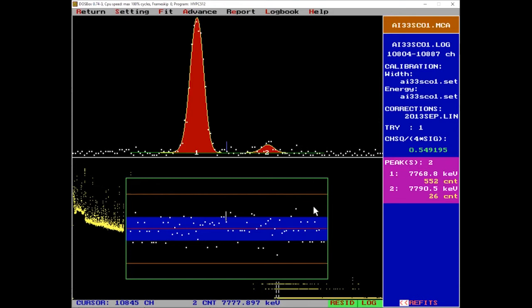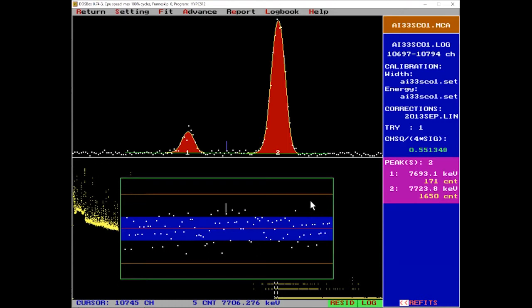and it should be like this if the counts follow the Gaussian distribution. And then this fitting is very nice if you need to decompose overlapping peaks, because for well separated peaks, we could also do simple integration, and that would give you the same peak area. But whenever there is a peak overlap, then mathematical decomposition by nonlinear peak fitting becomes necessary.